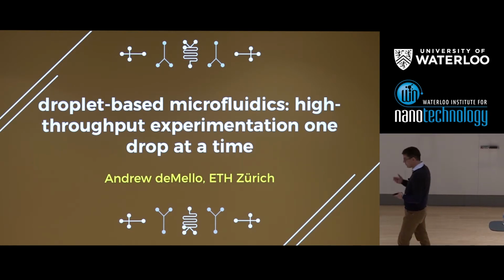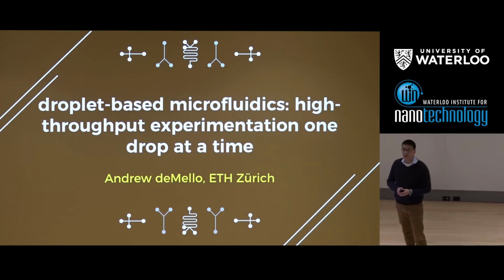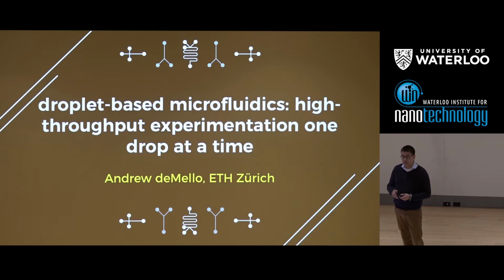that we've been doing in my group now for quite a few years, both at Imperial College London and at ETH Zurich, which is really focused on using very, very simple microfluidic systems to do chemistry and to do biology with a very simple view of improving efficiency to some extent. So you'll see examples of chip-based systems, of capillary-based systems, but the real idea or the concept behind a lot of the work that we do is, can we add advantage?